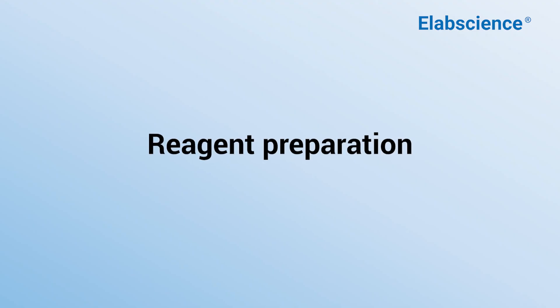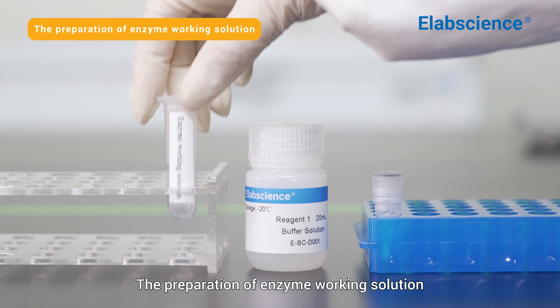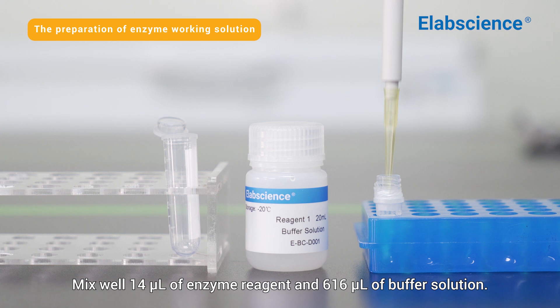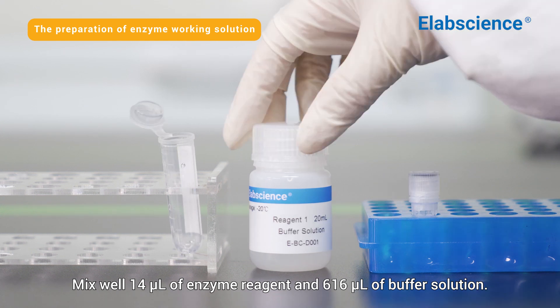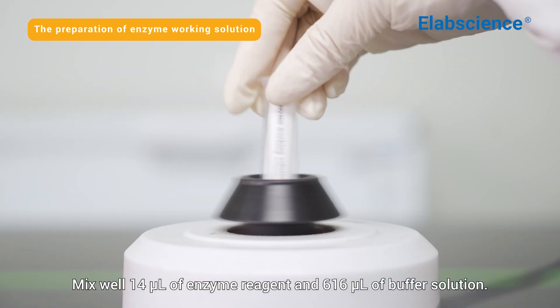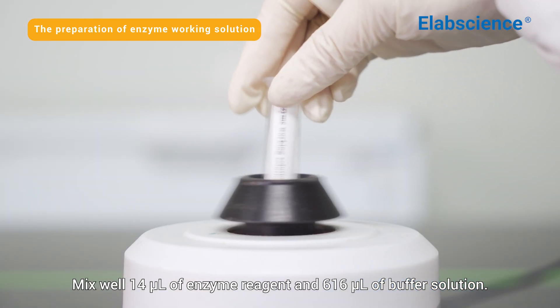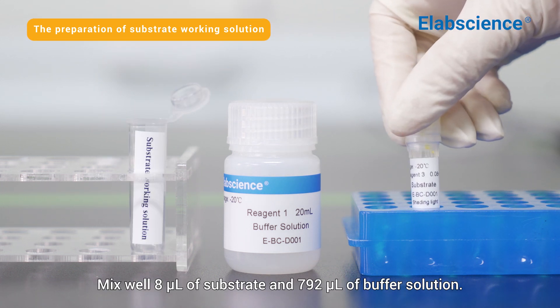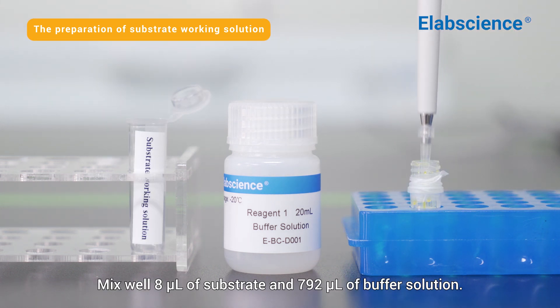Reagent preparation. The preparation of enzyme working solution: mix well 14 microliters of enzyme reagent and 616 microliters of buffer solution. The preparation of substrate working solution: mix well 8 microliters of substrate and 792 microliters of buffer solution.